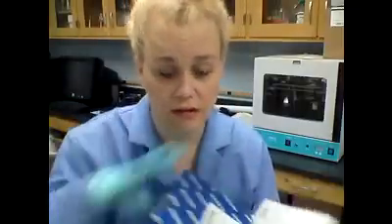And today we're on the purification process of how to extract the DNA from an agarose gel, and I'm going to run you through that process. I've already extracted the DNA, I've already run the gels, and basically I'm on the part where we're extracting and purifying the DNA from the agarose gel, and we're using this Qiagen kit.